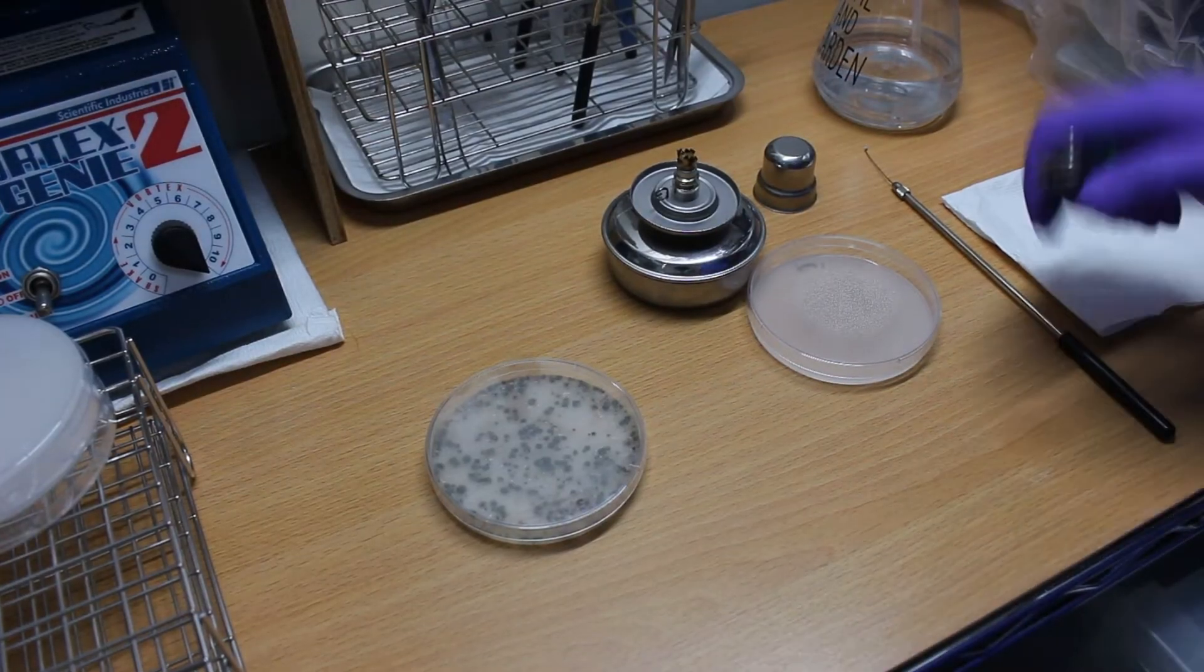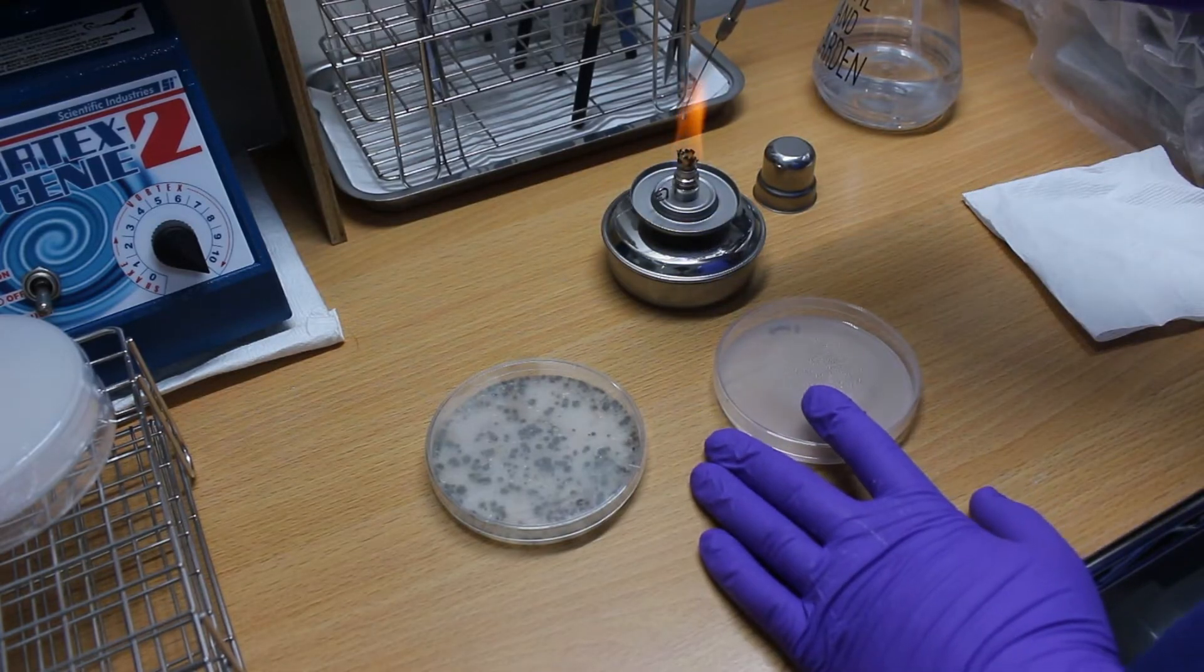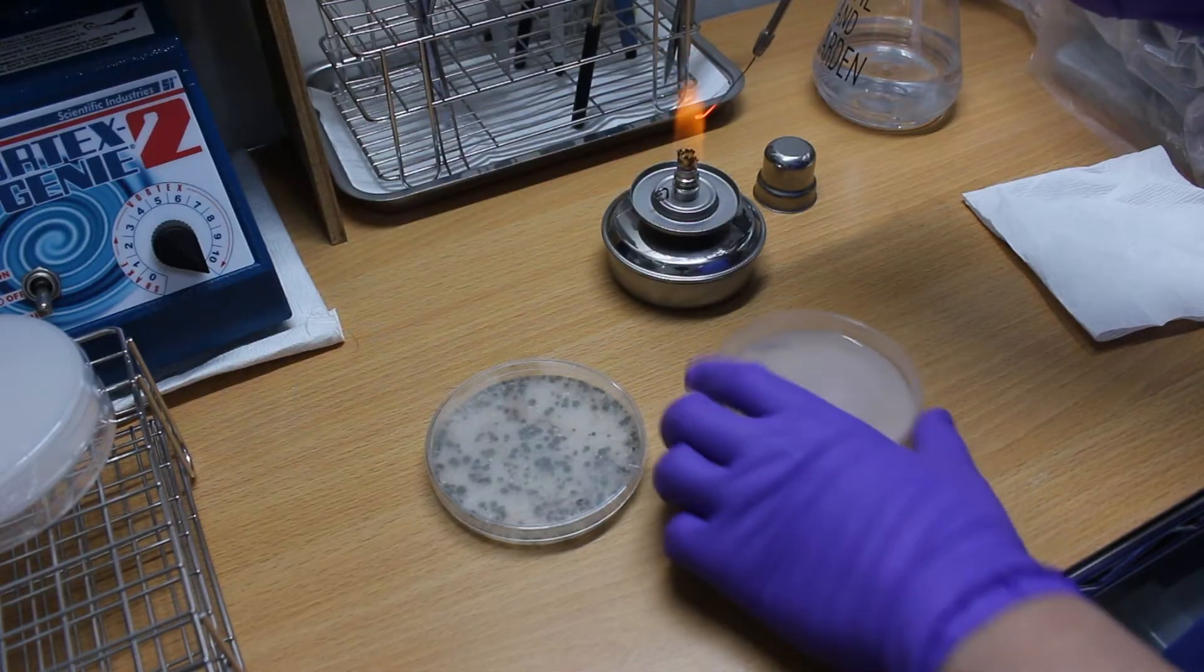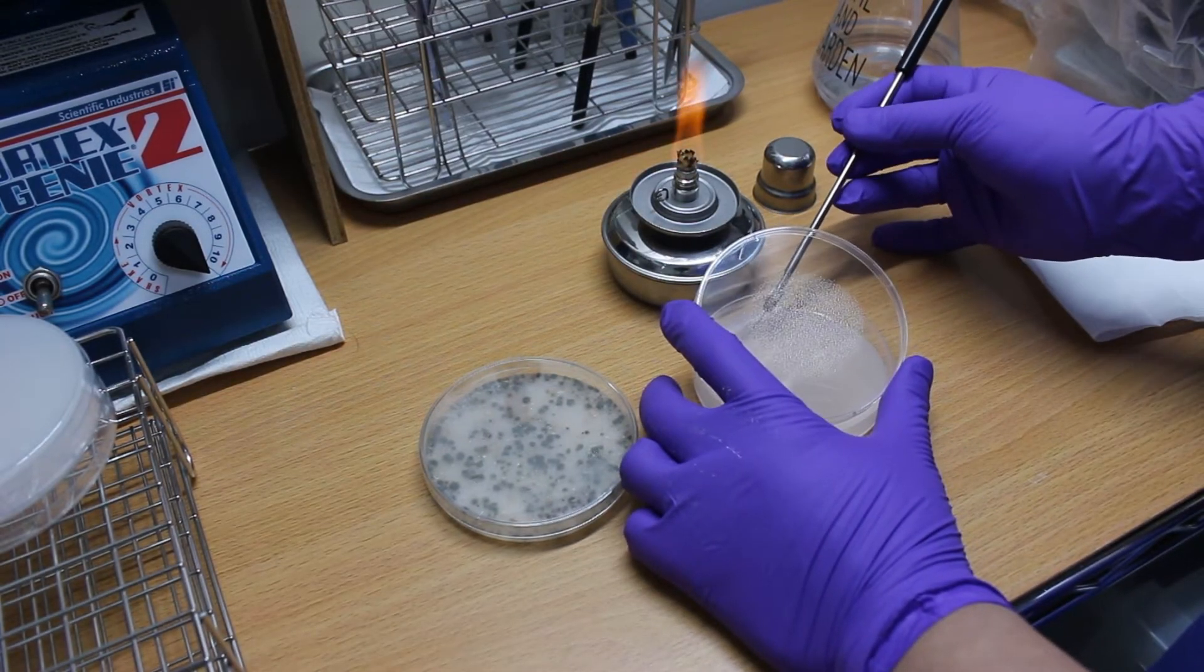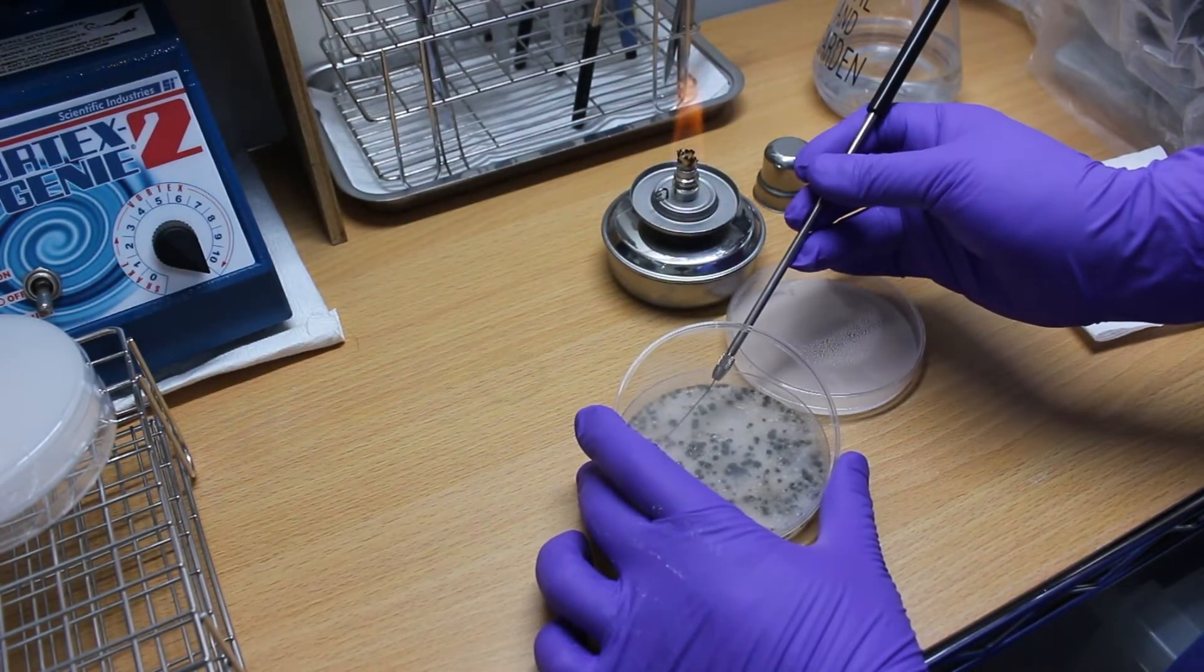Next, use the inoculation loop to transfer the bacteria colony to a new agar plate to isolate and purify it using the streaking plate method. I have a video you can watch about this method if you are not familiar with it.